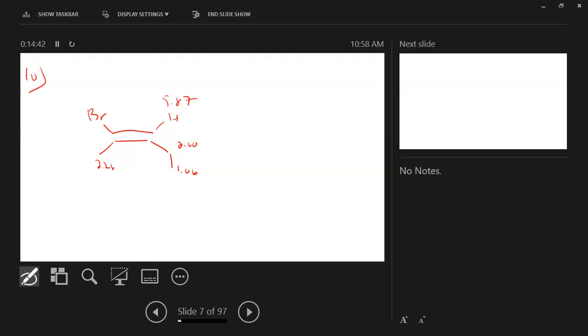All right, so let's do 11 on this same slide. The bottle is labeled only compound B, C6H12. They give you a chemical formula. It contains a colorless liquid. You've been called in as an expert, and they give you some IR spectra. They give you a proton NMR. And the NMR spectrum shows a typical isopropyl pattern, a septet, and a doublet.